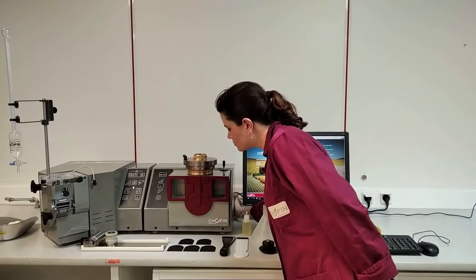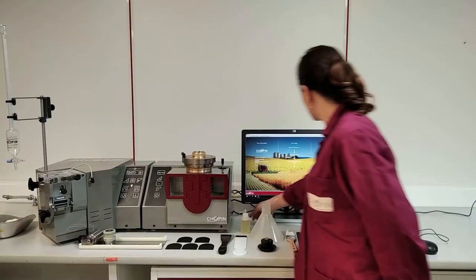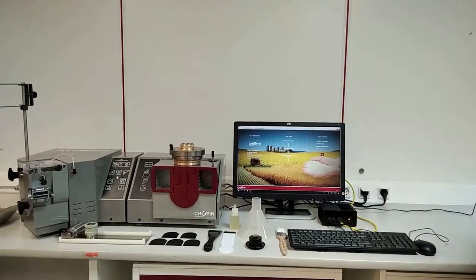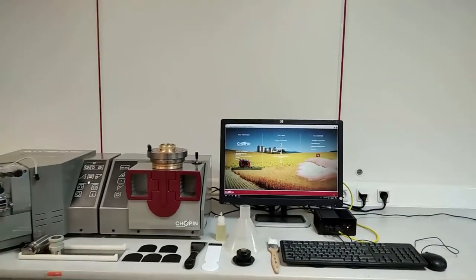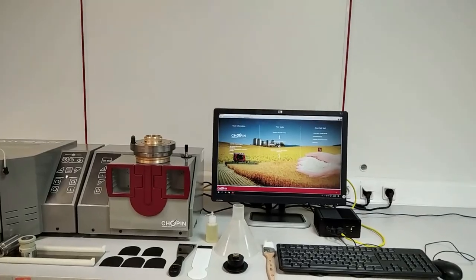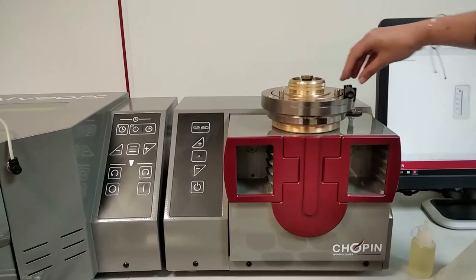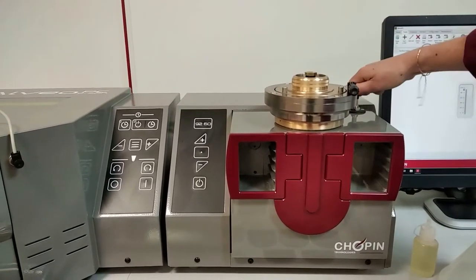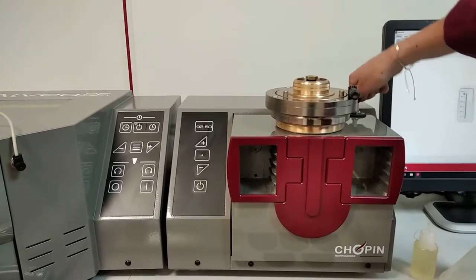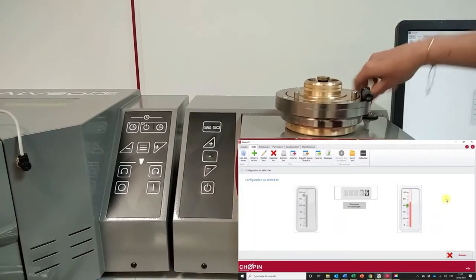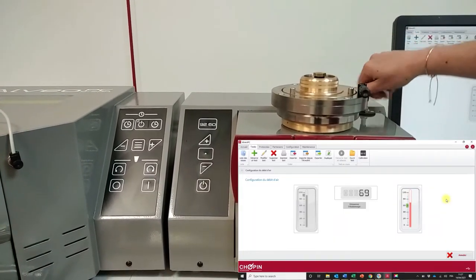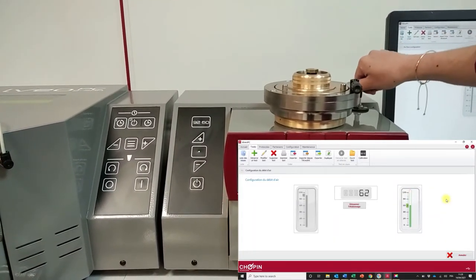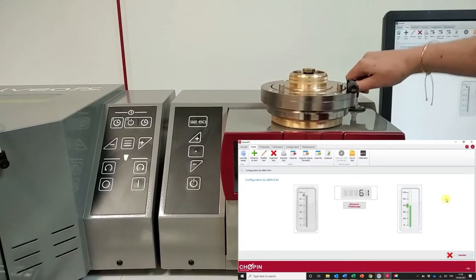Turn on the Alveo PC thanks to the power button. Then turn on the mini PC and the Alveo PC will be ready to run. Before running the first test of the day do not forget to calibrate the airflow by doing the 9260 thanks to the provided nozzle and to activate the cooling system.